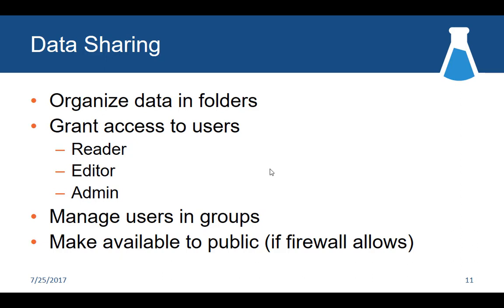But it is a great way to, like I said, support a publication or otherwise disseminate some of this data in a much richer interface than you would get if you just dropped it on an FTP site or something like that.